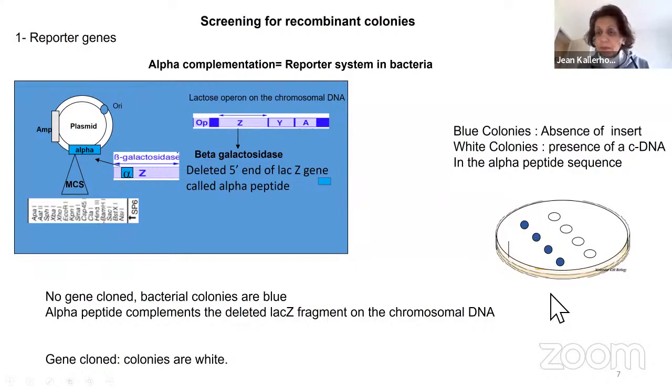This is a cartoon of a petri dish with blue and white colonies. In the blue colonies, there is no sequence inserted within the multiple cloning site.